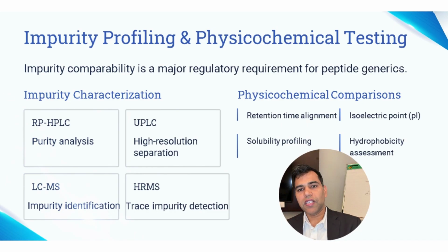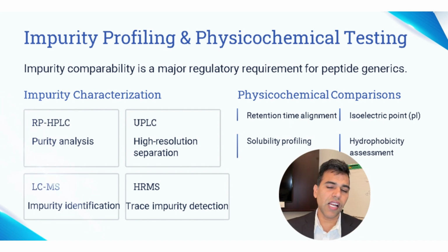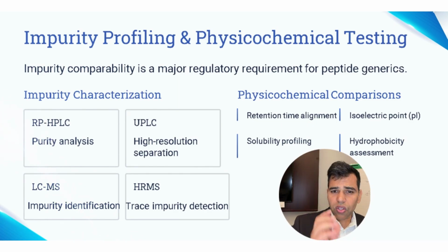One thing we have found at Resolve Mass in our work with complex generic peptides, co-eluting impurities are among the most common challenges. You think you are seeing a single peak, and it turns out that there are two overlapping species, one of which is a sequence variant you didn't know was there. Orthogonal chromatographic approaches with different stationary phases or mobile phase conditions are essential for catching this.